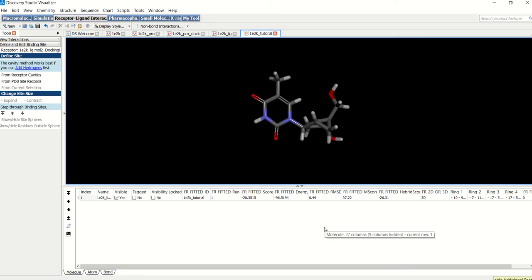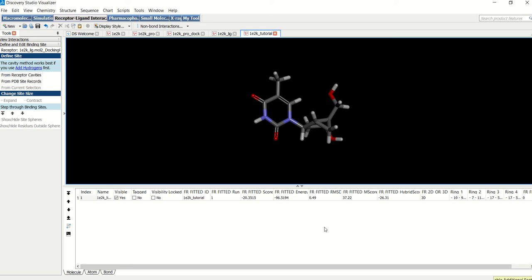Self-docking is more of a sanity check before you start your structure-based drug design project. And you should always do this step if you have an available crystal structure with a co-crystallized ligand. An RMSD larger than two suggests that perhaps the docking setup needs adjustment before proceeding with your structure-based drug design project.